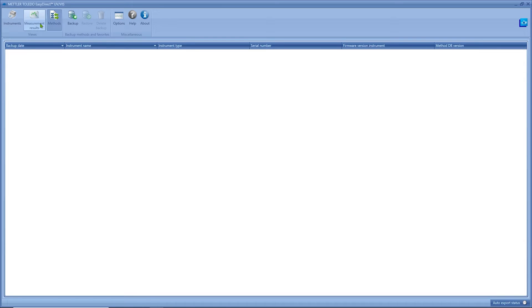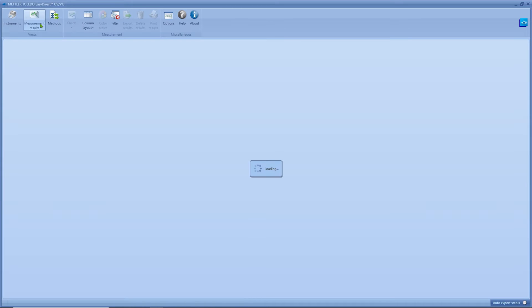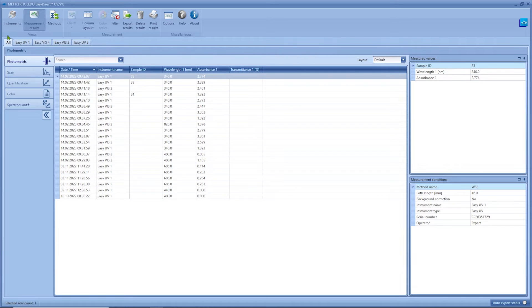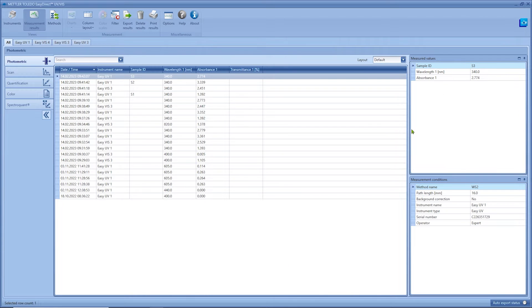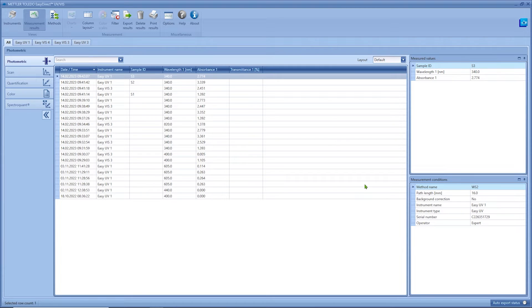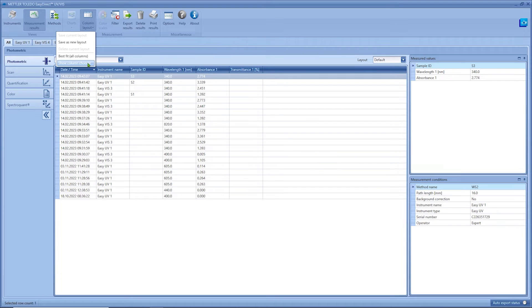As mentioned before we will now have a closer look into the view measurement results. On the top you can select for which instrument you want to display the results. Here on the left hand side you find the same measurement categories as on the instrument. Each category looks similar. You have the big results table in the middle and additional panels on the right hand side displaying result entry specific data. The layout of this main table can be configured and saved via the button column layout. This needs to be done for each category separately.